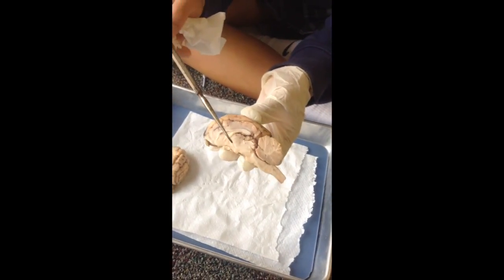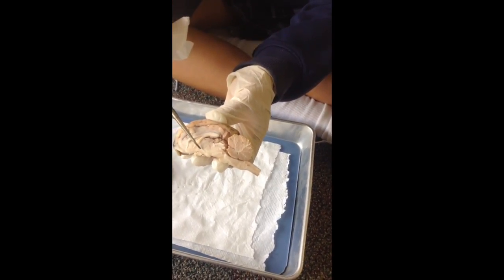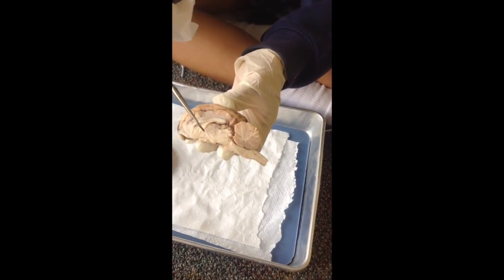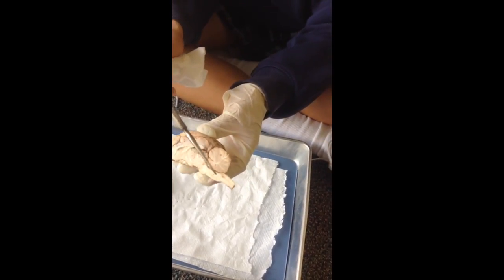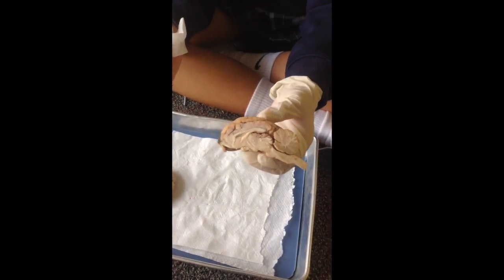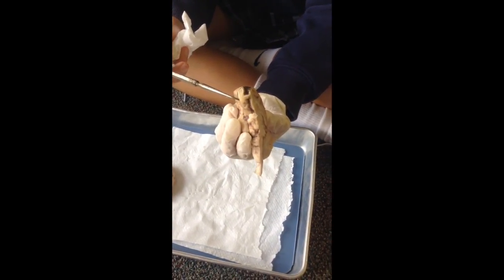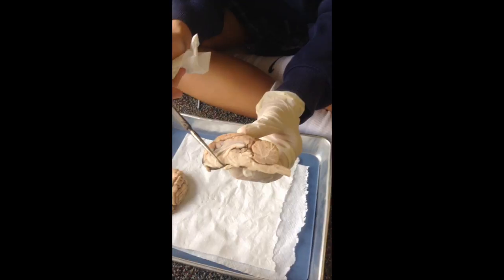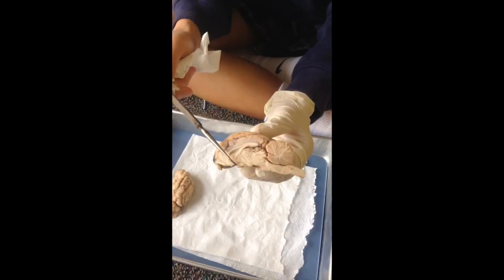The hypothalamus is a neural structure lying below the thalamus. It directs eating, drinking, body temperature, and helps govern the endocrine system through the pituitary gland and is linked to emotion. The medulla is the base part of the brainstem. It controls heartbeat and breathing. The olfactory bulb is the first brain structure to pick up smell information from the nose. Optic chiasma is the part of the brain where the optic nerves partially cross. It is located at the bottom of the brain immediately below the hypothalamus.